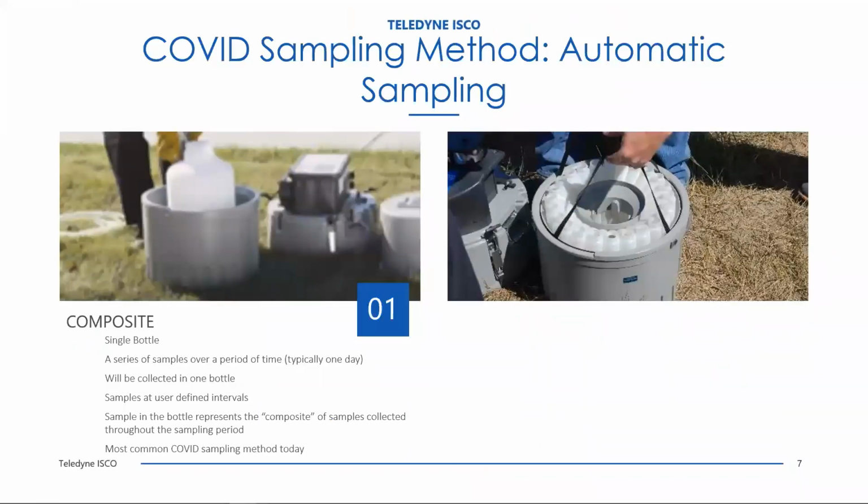The COVID sampling method involving automatic sampling typically will involve a composite sampler, which utilizes a single bottle. A series of samples over a period of time, typically one day, will then be placed in that bottle, and the samples will be collected based upon user-defined intervals. At the end of the sampling routine, the sample in that bottle represents a composite of all the samples collected throughout that sampling period. Today, this is the most common method utilized for COVID sampling.